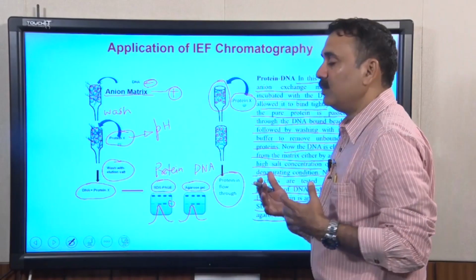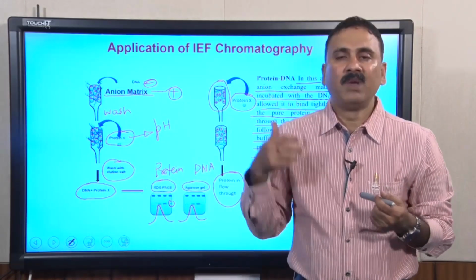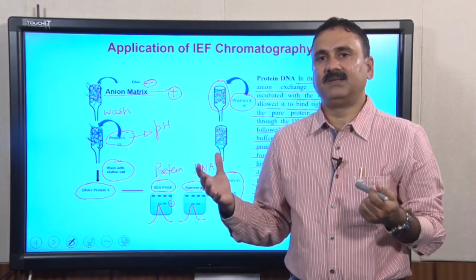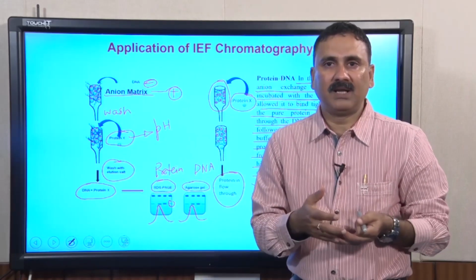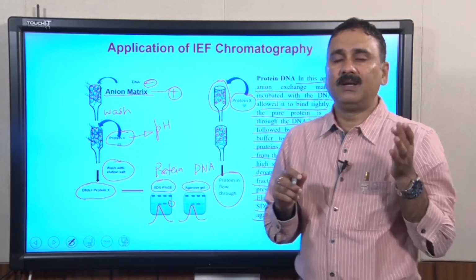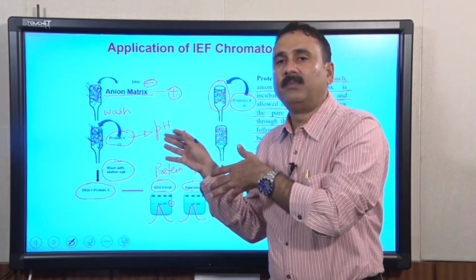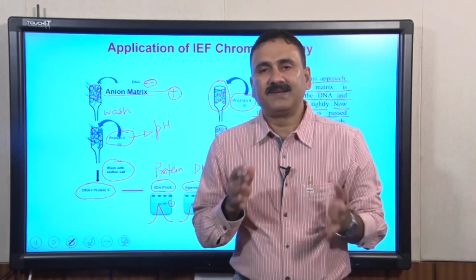When you do this experiment, it will say okay, protein X is interacting with the DNA, but to verify these things you can do control experiments, such as using the protein and its mutants, or performing similar experiments at a different pH, because you know that DNA and proteins interact through electrostatic interaction. So, if you change the pH, the pattern may vary.